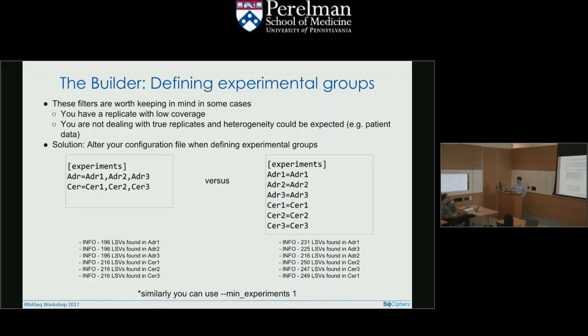Oh, okay. But it's something we want to change, since we want to make a different approach and create output from the builder based on groups that you define. So if I want to have overlapping groups, I should just run another builder instance. Yeah, right. Good questions.